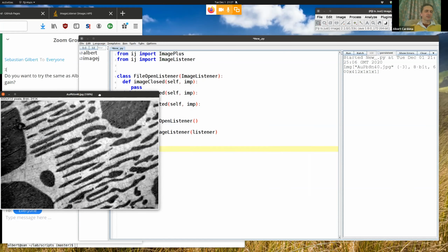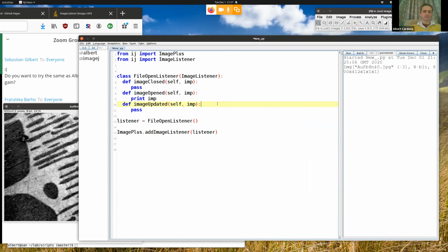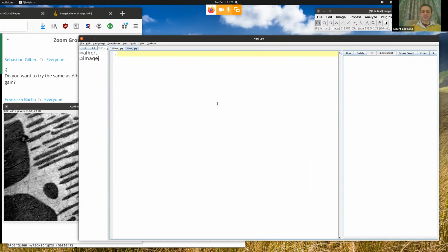So before I go into the bigger examples, I'm going to do these simpler ones just to illustrate what we're talking about. So let's do a new one. And now what are we going to do? Let's create a window. Like I said, this is called a frame. I'm going to use the Java Swing library to do this. And so I'm going to import here, it says from javax.swing import JFrame. I say, yes, that one. I know that it has an argument, and this argument is the title. So I'm going to say this is our first window. And then to this frame, we want to add a panel that can contain other things.